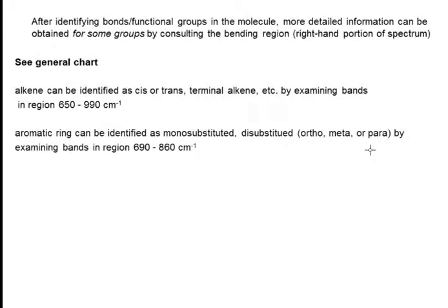Now, we mentioned that the bending bands can provide additional information. A bit later, we'll look at an example of that.